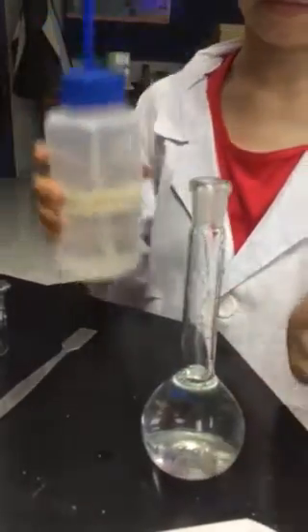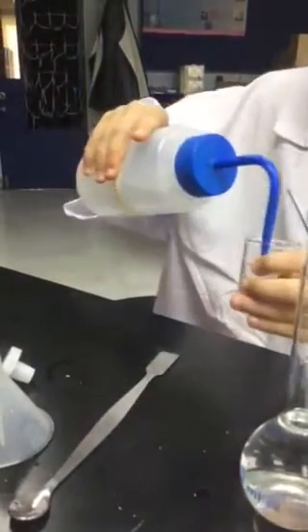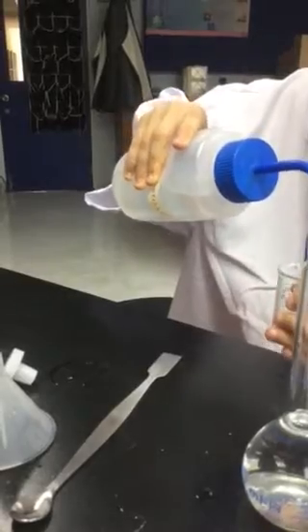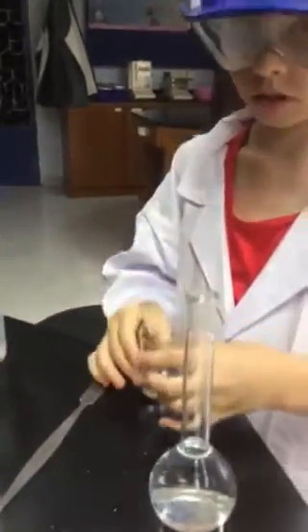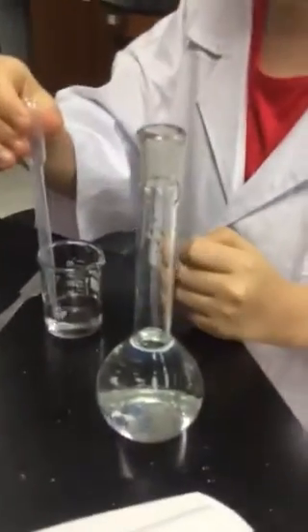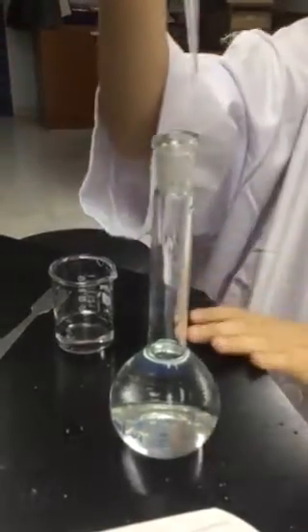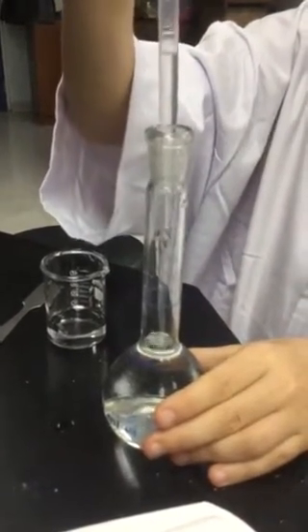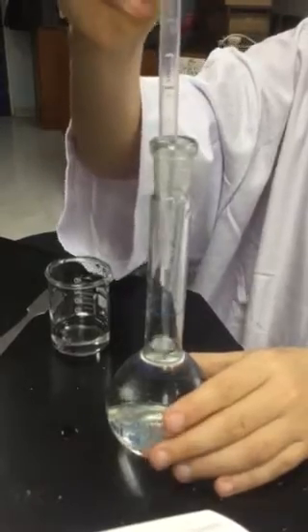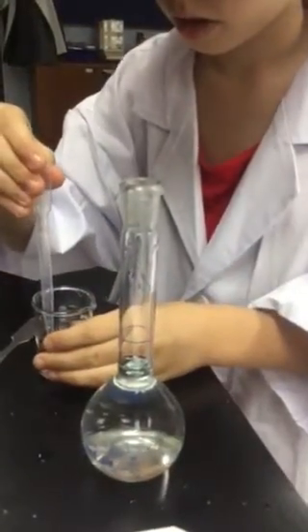Okay, Nina, I'm going to suggest we stop there. Can you put some of the distilled water into the small beaker? That's plenty. And can you take a teat pipette, sometimes called a medicine dropper, and use that to add water drop-wise until the bottom of our meniscus is just at the correct level. Okay. That's it, you need to get your eyes level. Try not to drop the teat pipette into the flask.